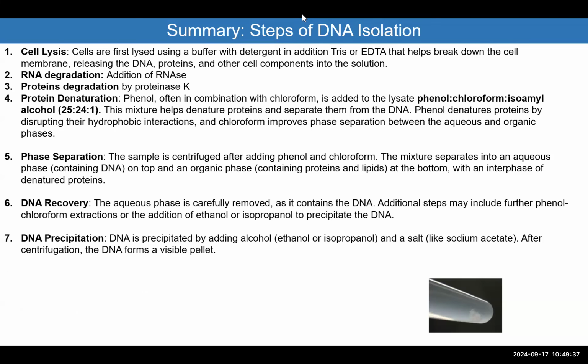Okay, I have somebody who's asking a question. Yes? I just wanted to ask how many times you would repeat these steps in order to get the best results. In the video, they only did it twice, but how many times can you do it before it might, I don't know, damage? In general, one is enough if you do it perfectly. Some protocols go 2 or 3. I will show you examples that the more you do it, the better. Okay, thank you.